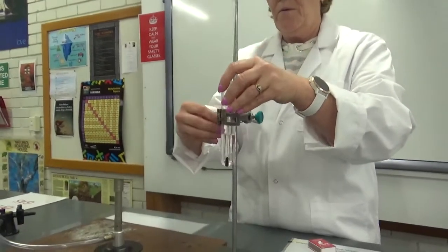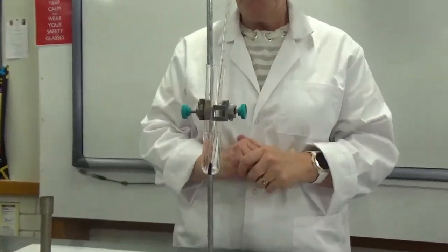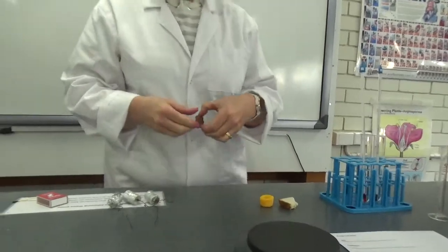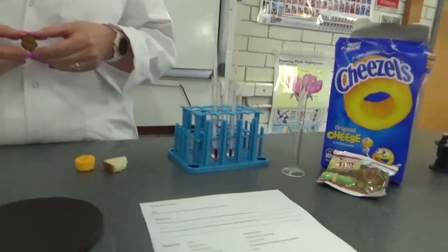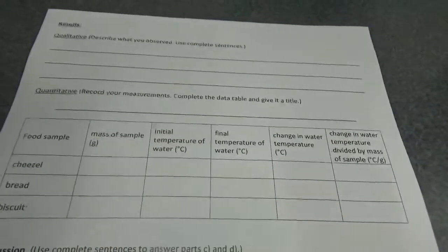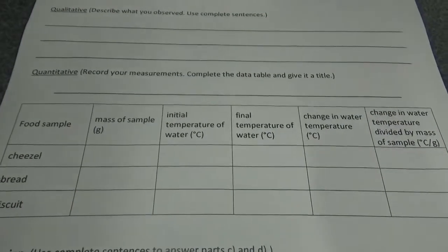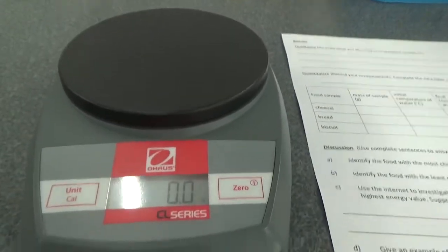We're going to put this up there ready to be heated by our food. Now we better weigh our food first. So on the other side of your sheet where it says the mass of the sample — we're starting with the cheezel. We're going to turn the balance on and we are going to weigh our cheezel.